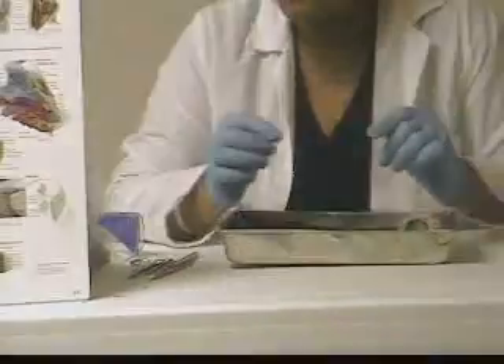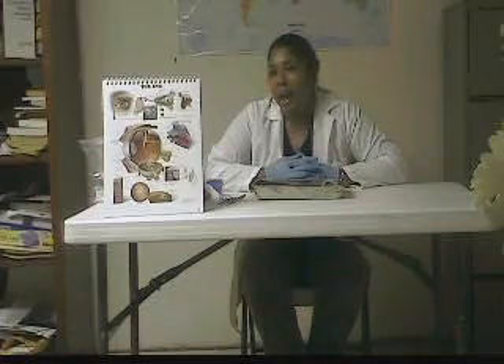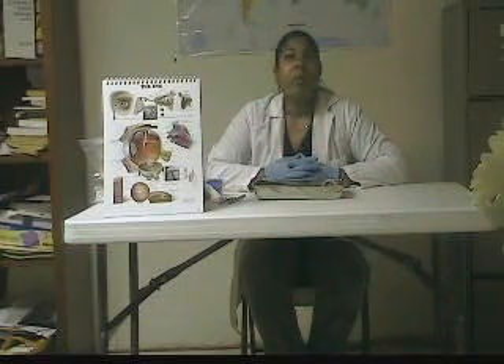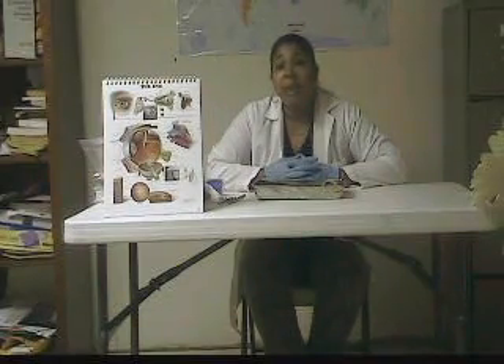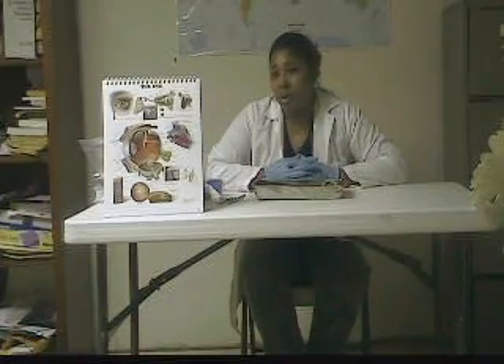Here is the lens of the eye — it's a very hard, tough structure. It separates the anterior segment of the eye from the posterior segment, and it also focuses light on the retina. The anterior segment is further divided into the anterior chamber and the posterior chamber — basically in front of the iris and behind the iris — and that's where you find the aqueous humor. The aqueous humor is generated by the capillaries of the ciliary processes, which are part of the ciliary bodies. Its function is to provide nutrients to the avascular cornea and avascular lens, and it also maintains the intraocular pressure of the eye.